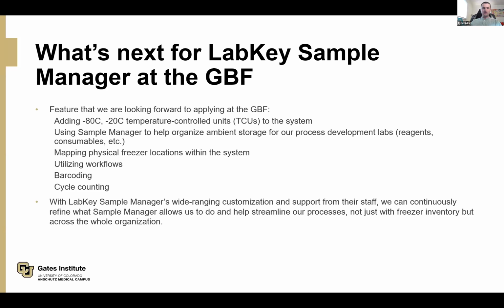And also, no one likes to open a freezer and have to dig around in all the frost in there and try and find what they're looking for. So I think by adding and mapping those units to the system, we can more efficiently have our operators locate and use those samples.